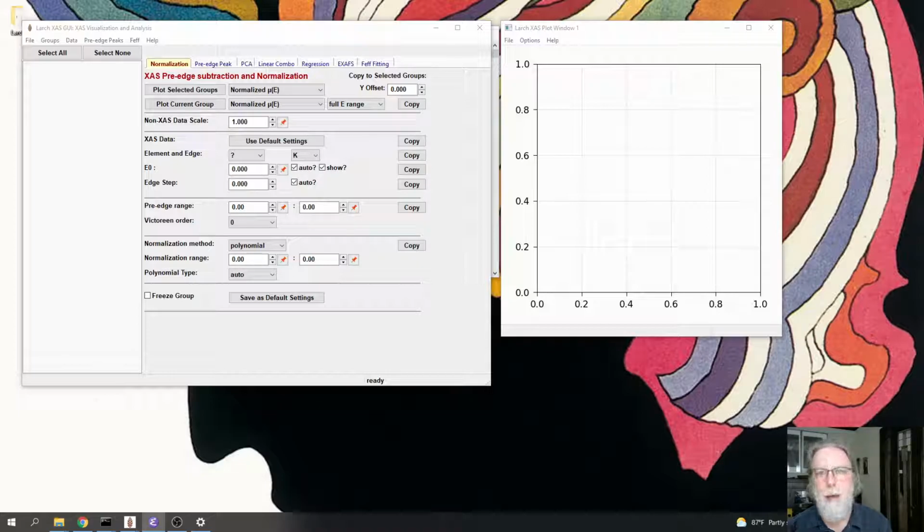That is, there would be a path from the absorbing atom to the first neighbor and back, and then a path from the absorbing atom to the second neighbor and back, and there may be paths from the first neighbor to another neighbor and then back home, the so-called multiple scattering paths, which can be important in some cases. All of these possible paths can contribute to the XAFS, though typically only a dozen or so of the paths will be significant for most experimental spectra.